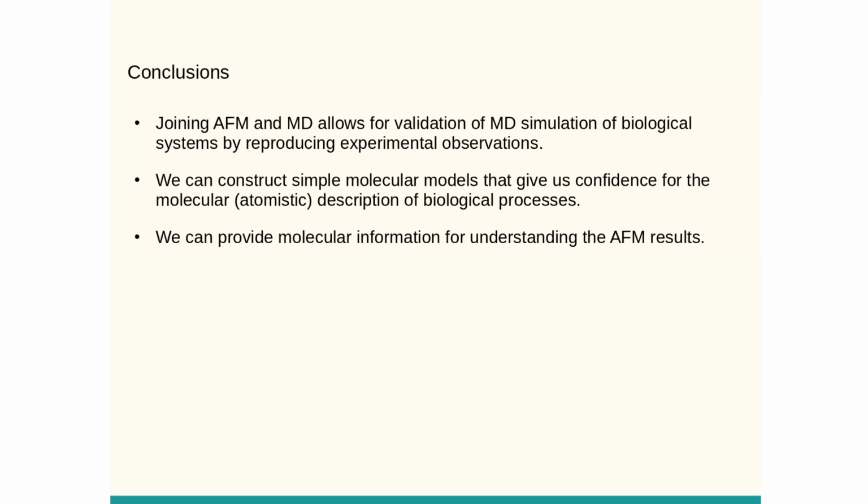Or, being more ambitious, going back to the very first slides, why the different proteins have that effect on the mechanical properties of lymphocytes. That's a lot more difficult because you have a lot more things, you have the cytoskeleton, but that's looking to the molecular reasons for those differences.